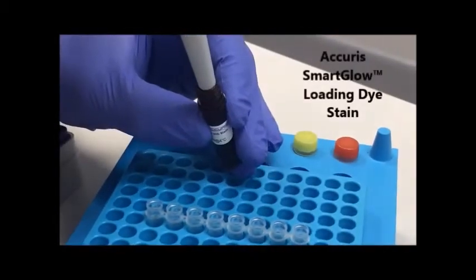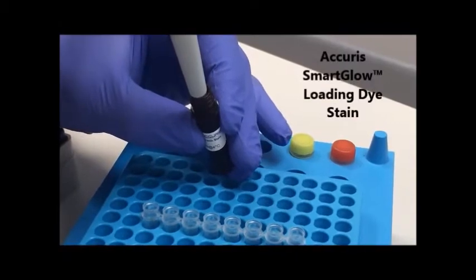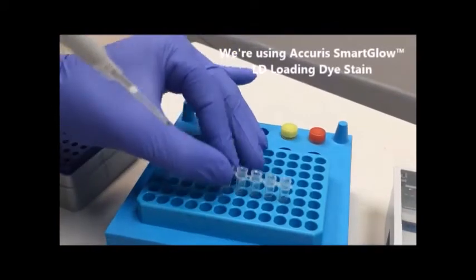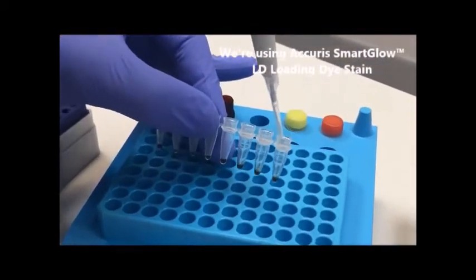For this demonstration, we are using Smart Glow Loading Dye Stain. We are going to be adding 1 microliter to each 5 microliters of DNA ladder.